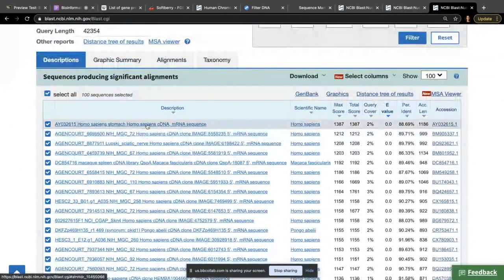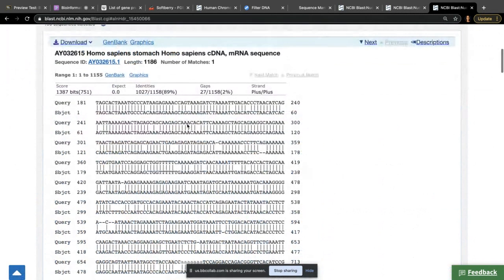So, okay, it is some mRNA sequence. So we could see where within that sequence that I entered, it matches an mRNA sequence, which gives me biological information that corroborates information about where the genes were predicted. Okay, corroborates if they match the same spot. But I do know that that sequence matches some mRNA sequence.